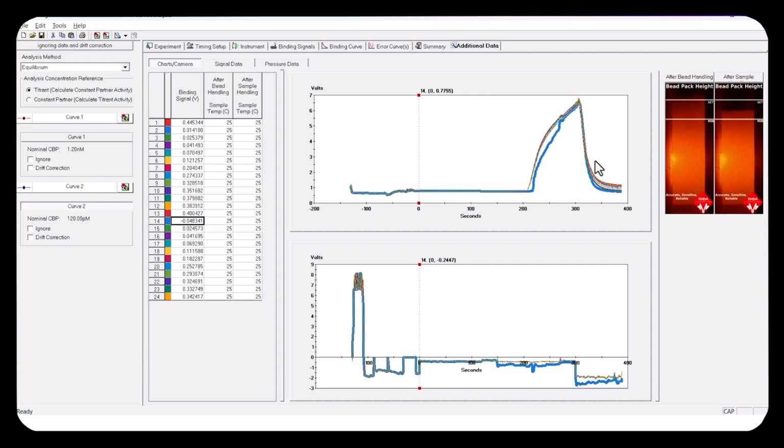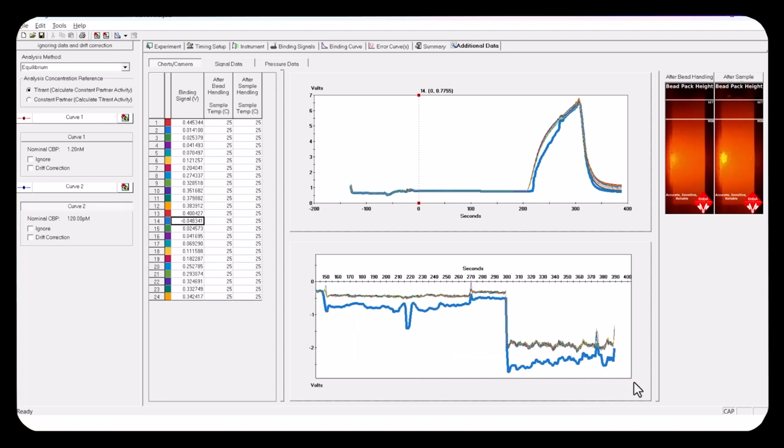And when I get to this trace, I can see it clearly. It definitely is the same trace that looks like it's pretty low in here. It's the lowest one in this elbow, and it's right near the bottom of the group on this end as well. And the other thing I look at here is I notice that there is a pressure anomaly. I'm going to zoom in here. So I'm holding down the Shift key and clicking and dragging my mouse. When I do that, it zooms in on that portion of the curve.